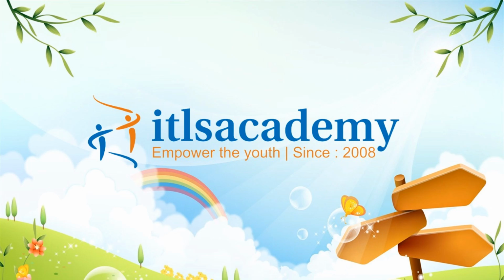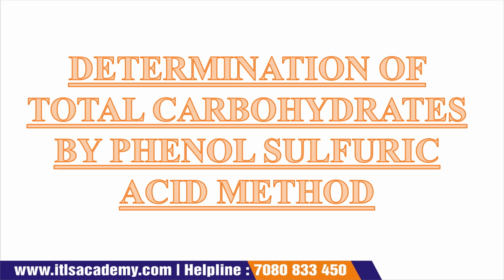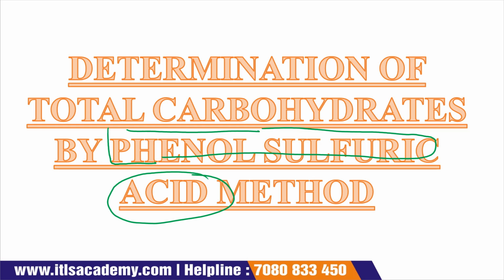Today we are going to discuss the determination of total carbohydrate, and the method that we are going to use is the phenol sulfuric acid method. Okay, so we are using the phenol sulfuric acid method. We all know that carbohydrate plays a very essential role in providing energy.